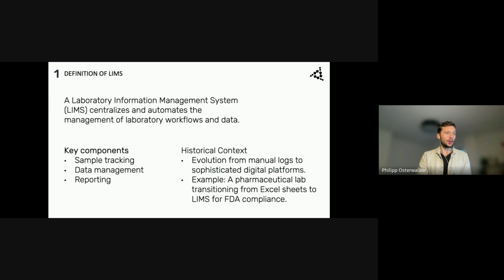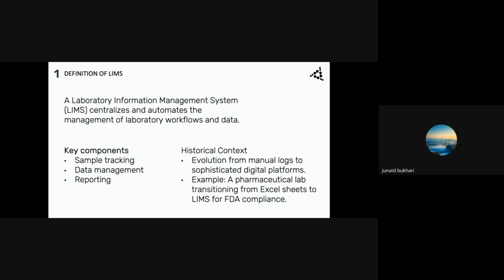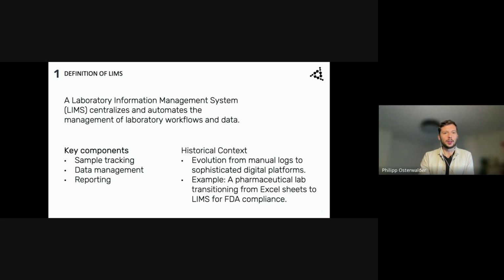For a historical context, the evolution from manual logs to sophisticated digital platforms. An example here from a pharmaceutical quality control lab, transitioning from their Excel spreadsheets, where they had a lot of them, to one centralized LIMS for the FDA, Food and Drug Administration, compliance.